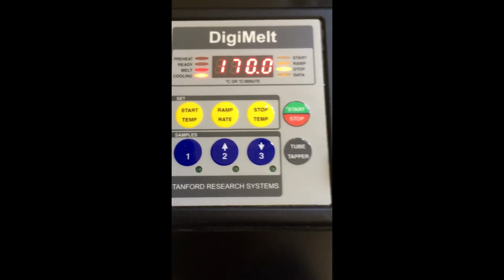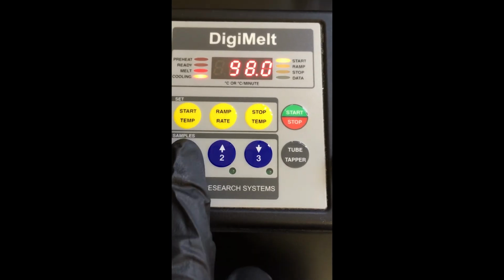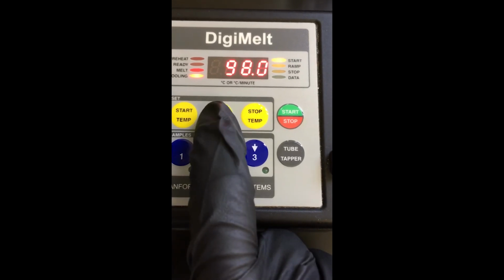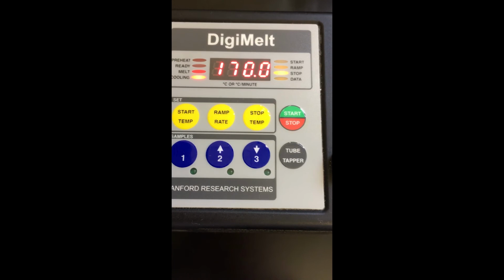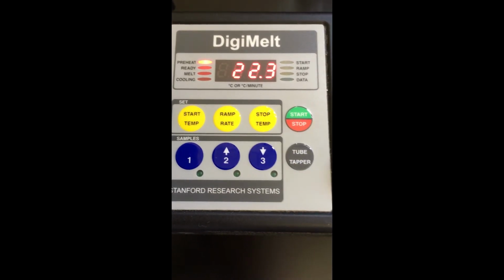Alright, so for this melting point, for the Diels-Alder reaction, I'm just going to set a start temp of about 98 because the product is supposed to melt at 104, a ramp rate of 2 degrees per minute, and a stop temp of 170 degrees. And then I'll go ahead and start and get the block preheating so that then I can do the melting point.